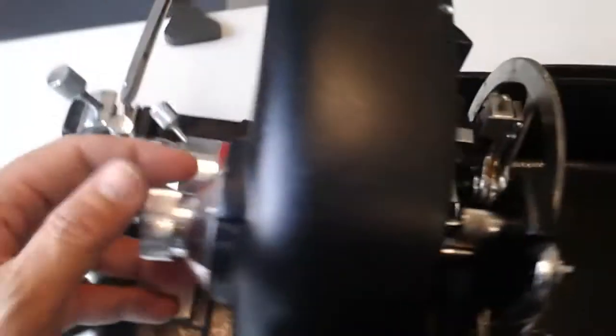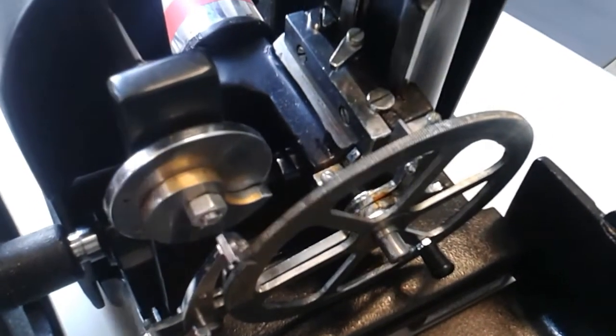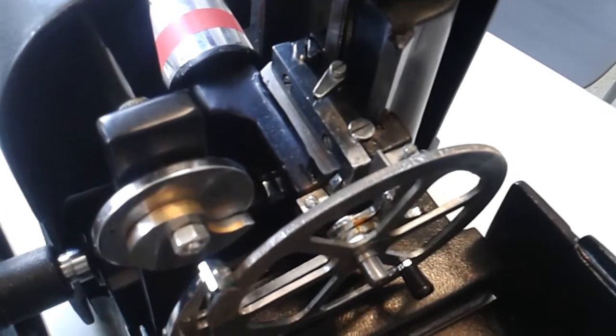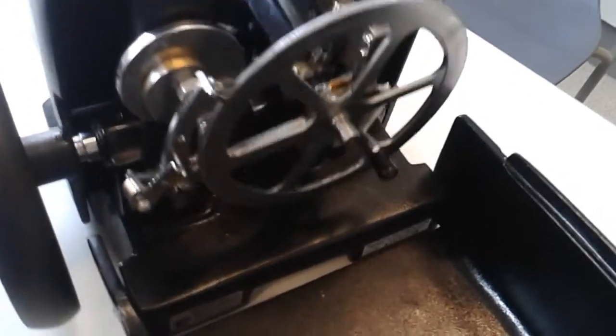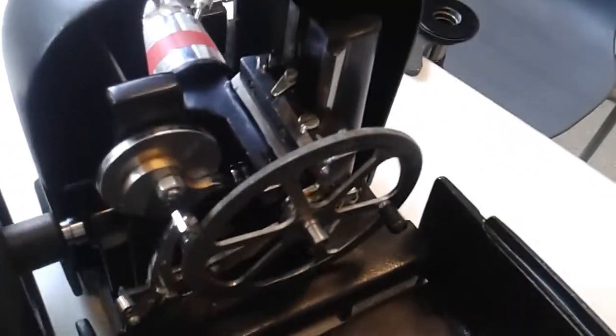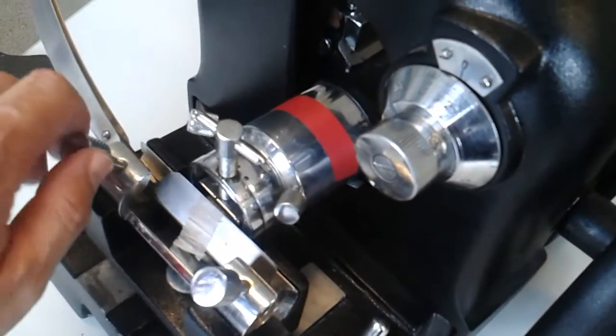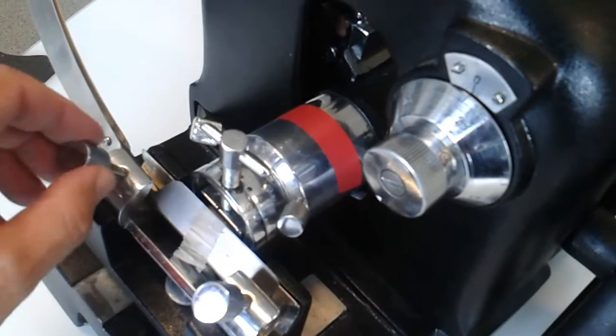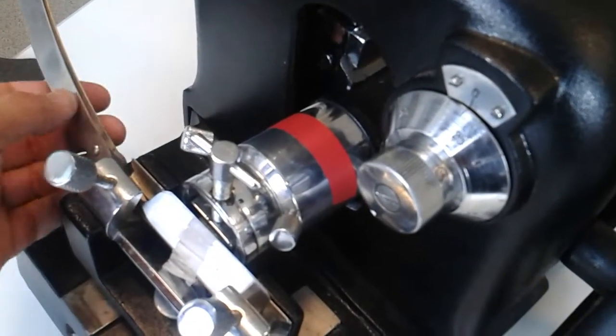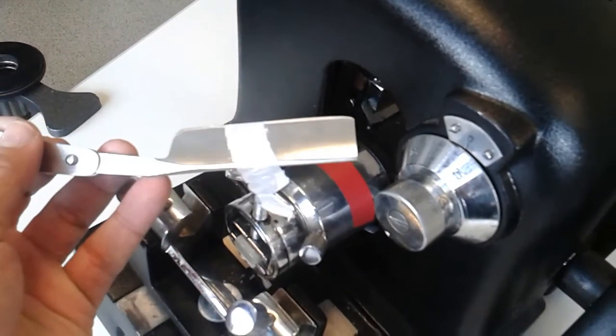By turning this wheel over here, you can adjust this part, which then adjusts the thickness of the specimen. The rotary microtome knife itself can be removed by unscrewing these two screws over here, then you can carefully remove the knife and store it in a safe place.